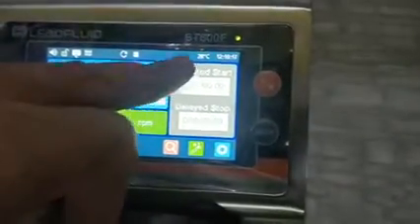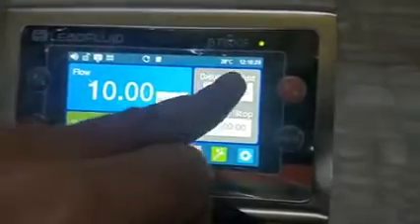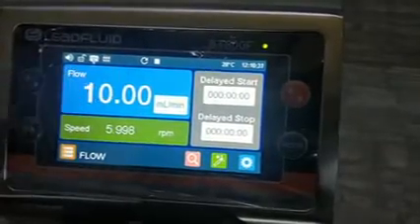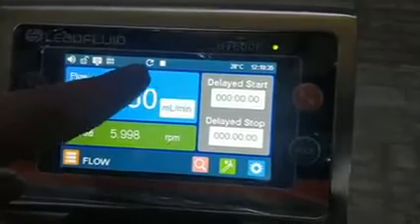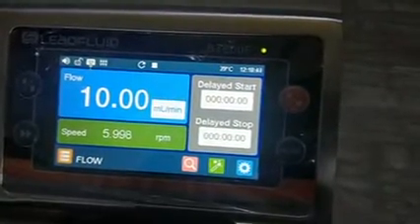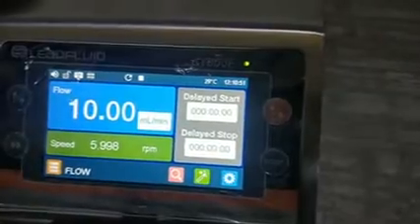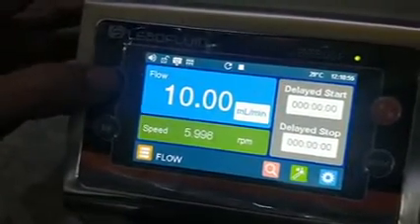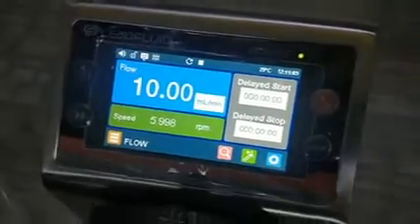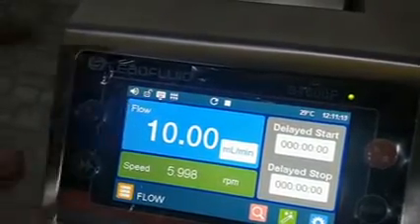The display shows temperature — currently 28 degrees Celsius — and timing, along with some icons. This icon shows the rotation of the head; clockwise means it takes solvent from the left and dispenses to the right. If you want to change rotation, you can do so from this button. So now it is anti-clockwise; I am making it clockwise again.